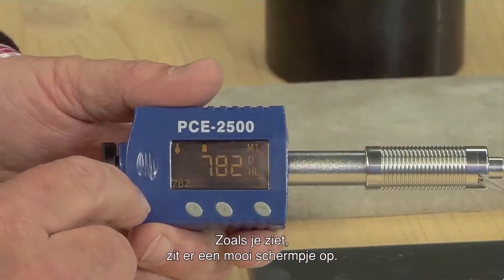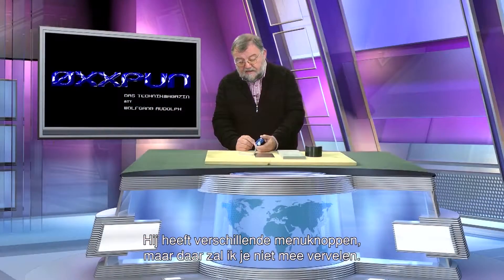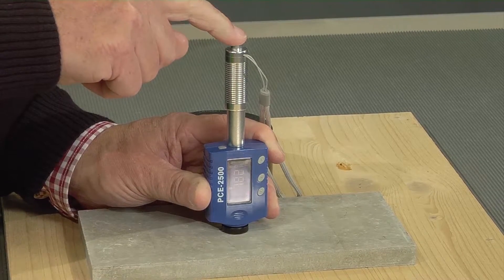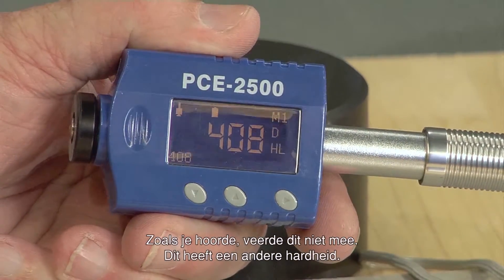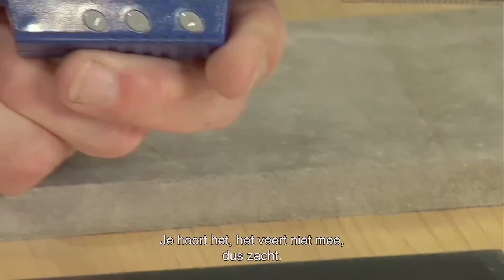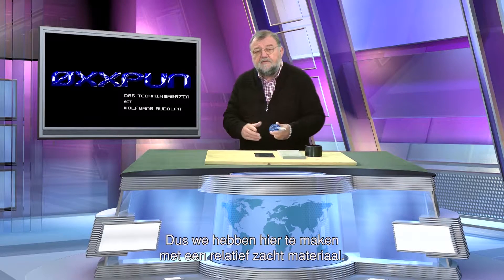It has a wonderful display and different menu points which I can set. I just want to show you that on different types of materials, it is possible to quickly determine the hardness up to 940 HV. As we have heard, we don't have the same jump here. We have a different hardness — it is a softer material — it shows us 408 HL. And here I have an aluminum plate. When I try here, I load it and let go, and you can hear it doesn't jump as much. We can see a hardness of 277 HL — a relatively soft material.